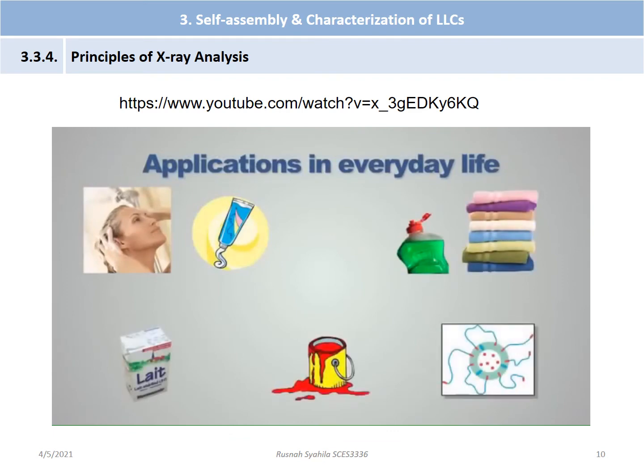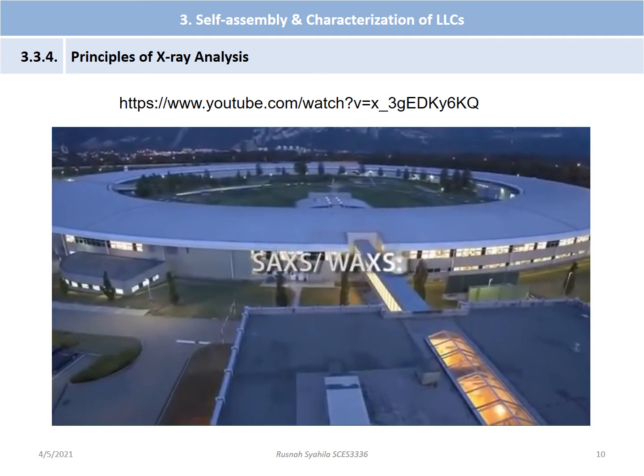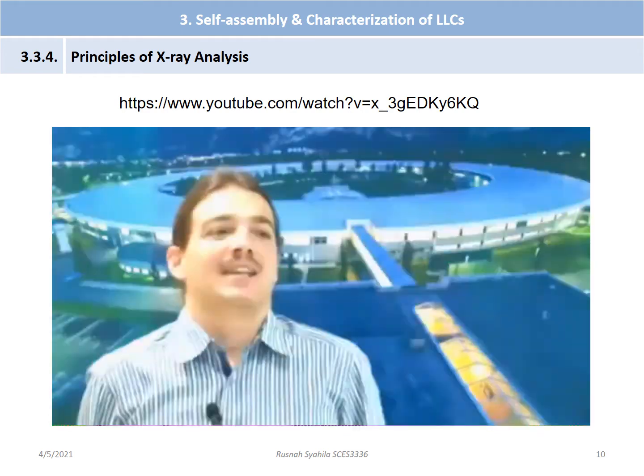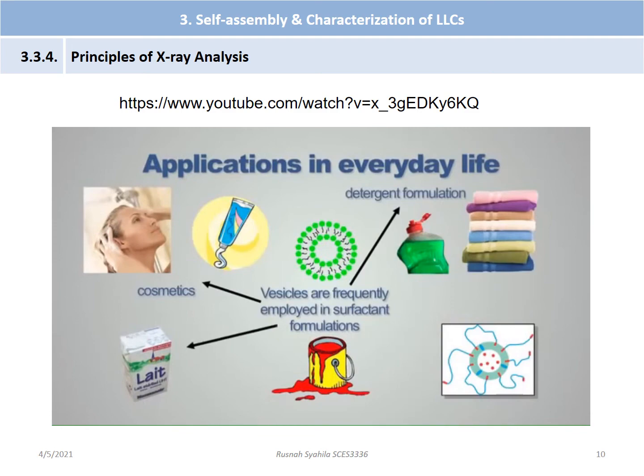All these products contain colloids, proteins, polymers or surfactants. And the final self-assembly of these building blocks into, for example, micelles or vesicles determines strongly the conformation of the final product. The investigation of vesicles is important for cosmetics, for detergent formulations, but also for pharmaceutics as drug carriers.